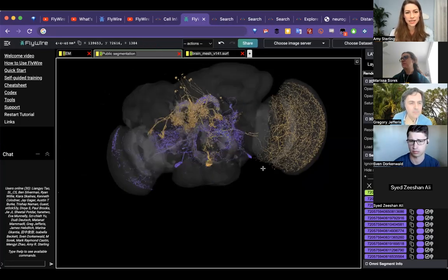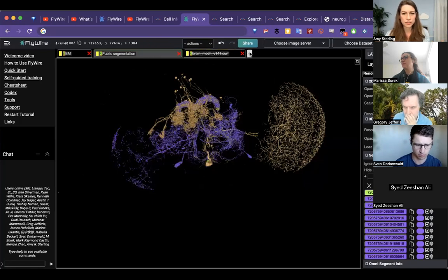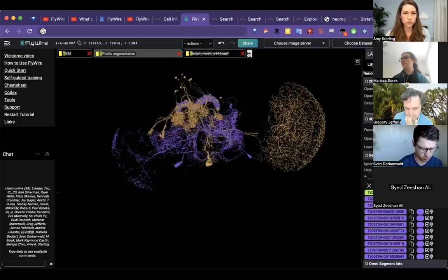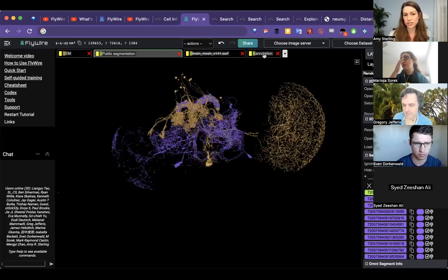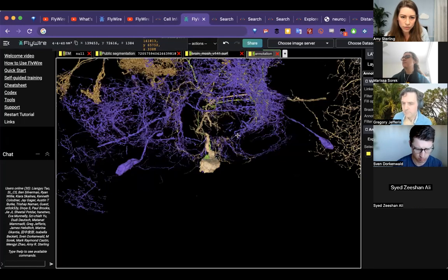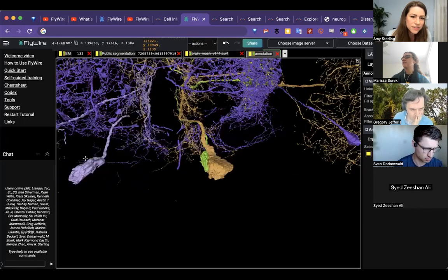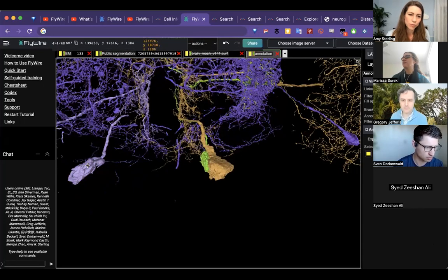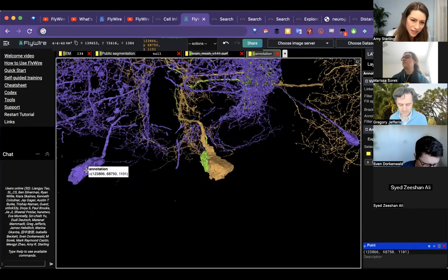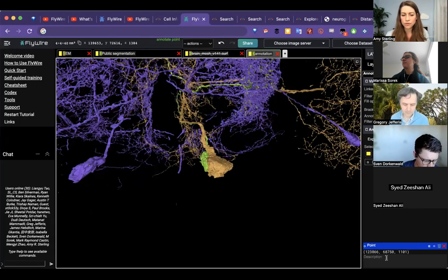And then the last thing that I wanted to show within FlyWire, I'm going to turn off the brain mesh, is that you can add annotation layers. So if I just control click on this, it adds this new annotation, and you right click to open this layer, and then you can select whatever 3D component you want to lead your annotation, and then you control click and it's going to leave. Well, I think I have too much segmentation, but normally control click. There we go. Got a little annotation right here, and you can make a note right here.